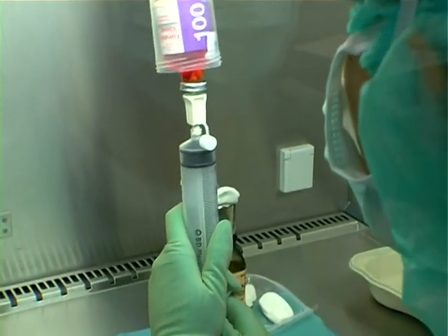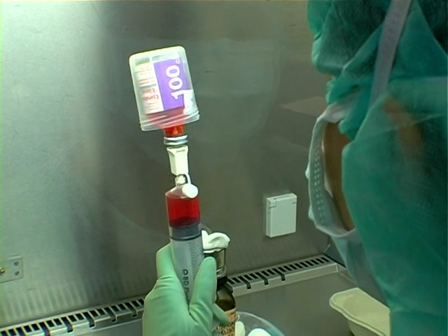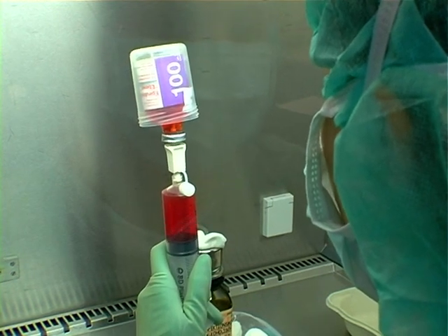For withdrawal of medication from the vial, the Oncosafe can be turned upside down, since the vial is firmly fixed to the bottom.